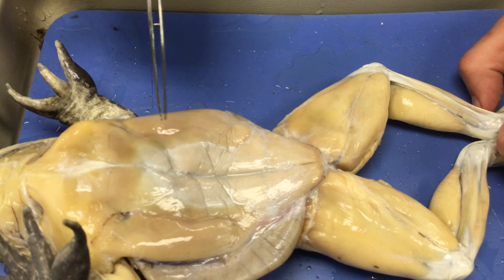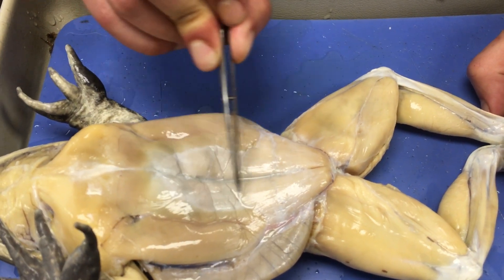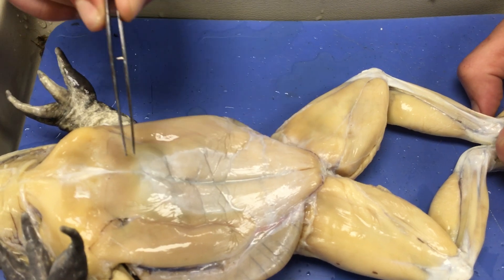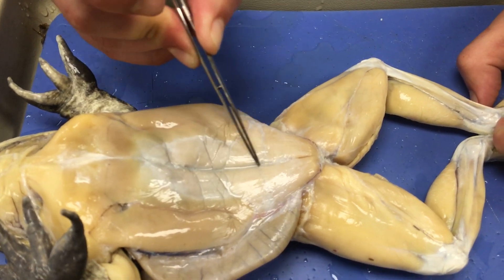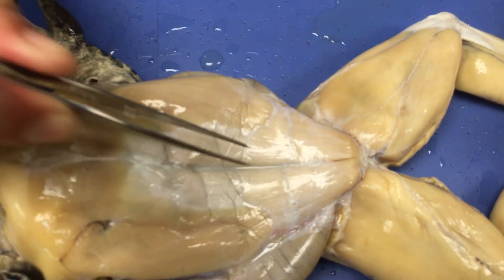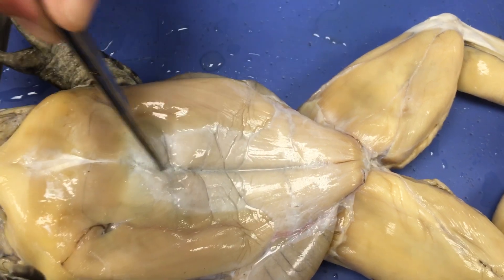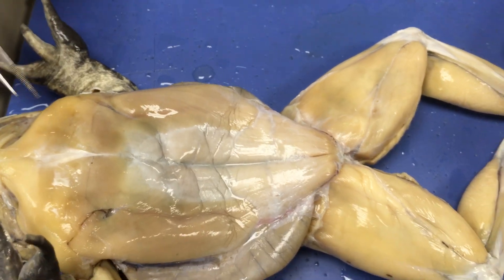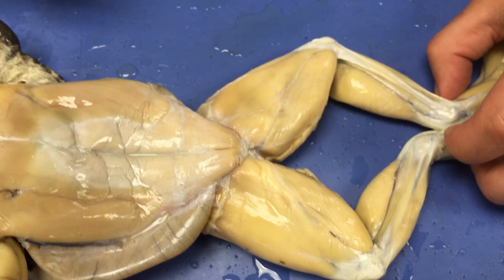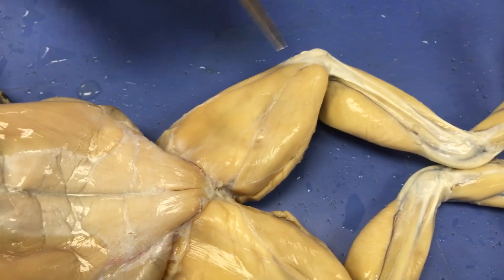Next we have the rectus abdominis — just like your abs, your abdominal muscles. There is a distinct separation of connective tissue that splits the rectus abdominis into two columns, and that is called the linea alba. Now we get to the underside of the leg, where the musculature is the most complicated.